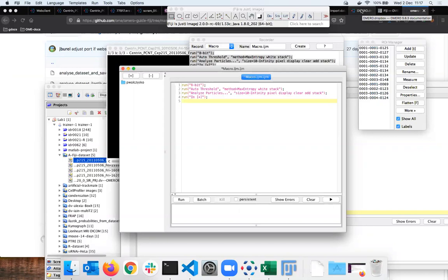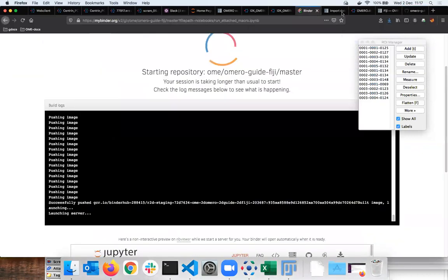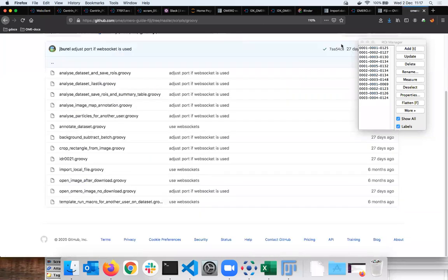And we'll show you another tool afterwards. Another advantage, and we have colleagues in Dundee that work that way, is they do analysis in one software, in that case doing some tracking in Python. They save the result into OMERO, do the attachment, and do further analysis in R, but at least they have better control of where the analytical results end up.